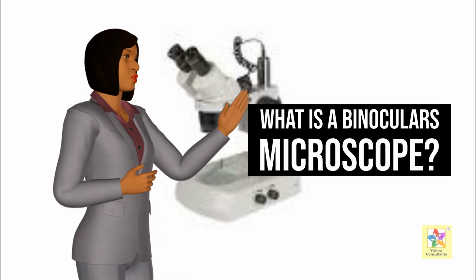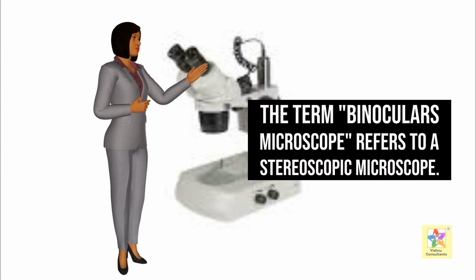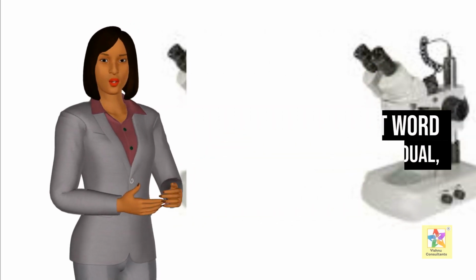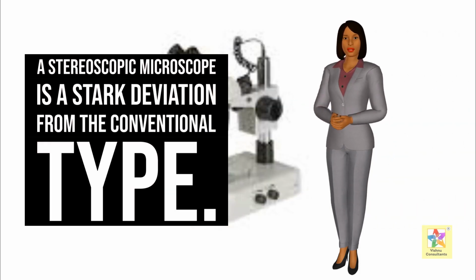What is a binoculars microscope? The term binoculars microscope refers to a stereoscopic microscope. From the root word stereo, meaning dual, a stereoscopic microscope is a stark deviation from the conventional type.